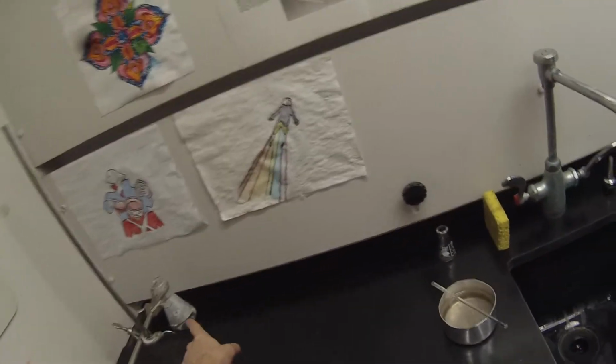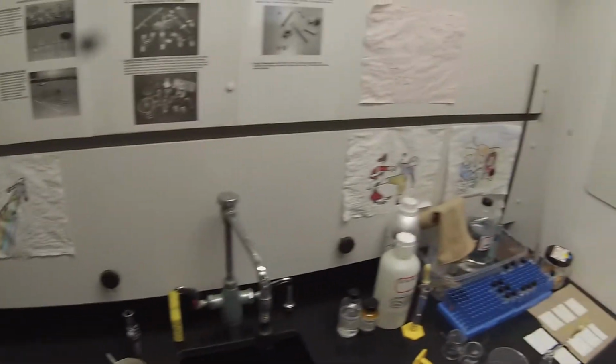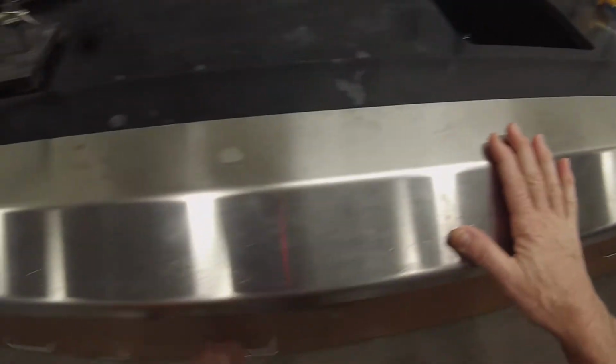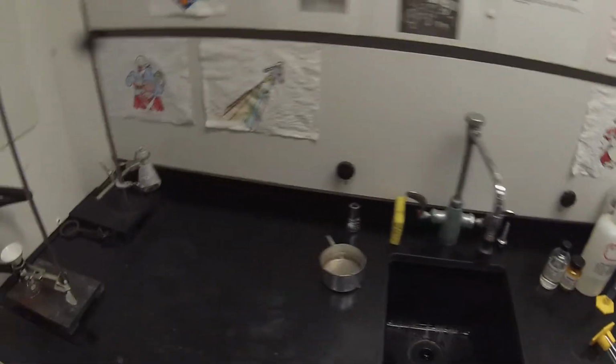So while that solution of acetanilide is cooling, which is going to take a while, in order to be efficient, we might as well start getting the second step set up. And the second step is also going to be run in a 125 milliliter Erlenmeyer. I'm going to go ahead and use the same stir bar. It's still a little wet, but it's an aqueous solution anyway.